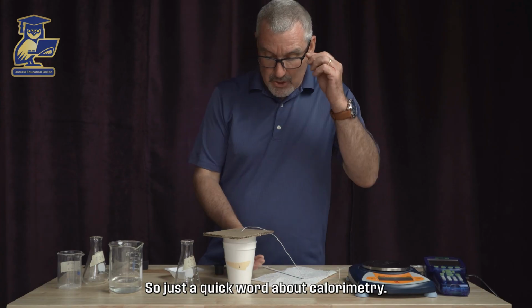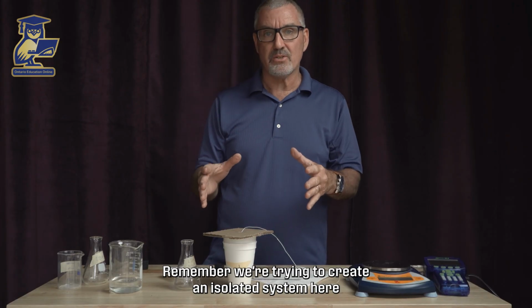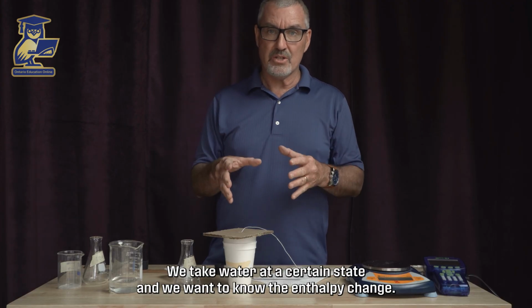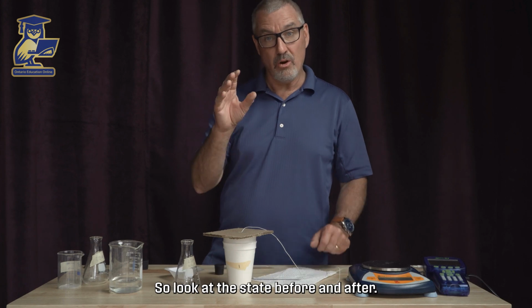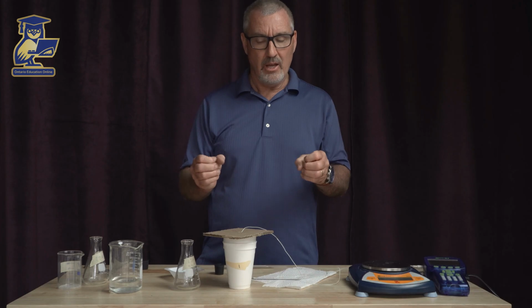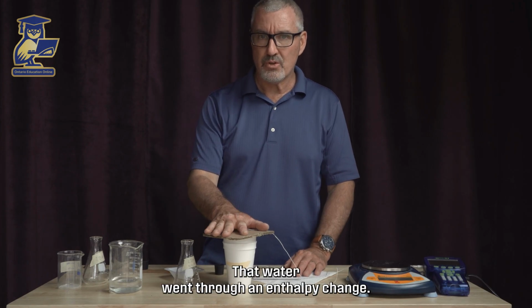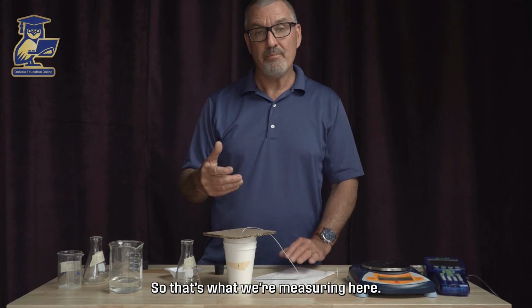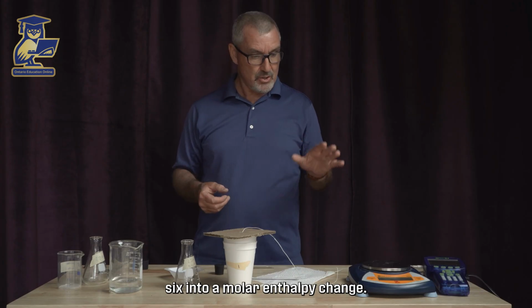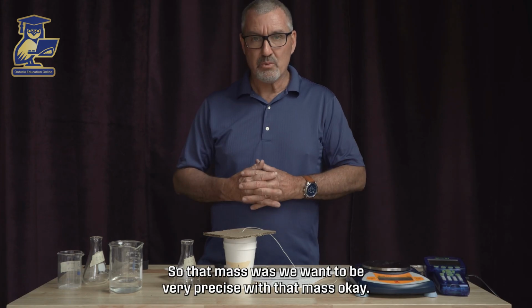So, just a quick word about calorimetry. Remember, we're trying to create an isolated system here, which means no heat gets in, no heat gets out. This is its own universe. We take water at a certain state, and we want to know the enthalpy change. So, look at the state before and after. Before, we were at 19 or so degrees. And then shazam, something happens, we're down to 13.4. That water went through an enthalpy change, all right? So that's what we're measuring here. And we're going to have to, of course, change that for equation 6 into a molar enthalpy change. And that's why the mass was so important, right? So that mass was, we want to be very precise with that mass.